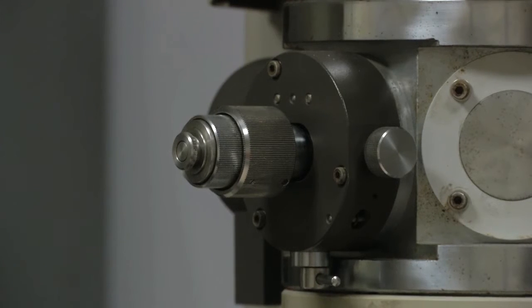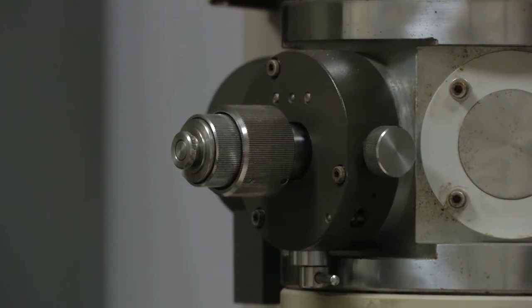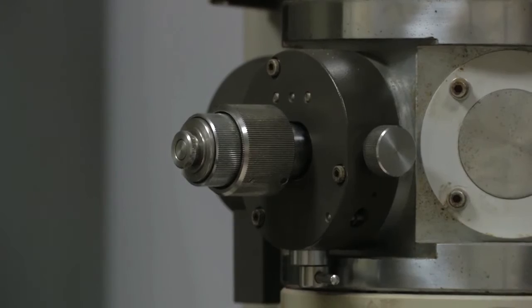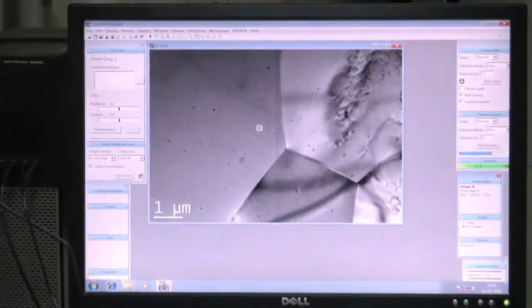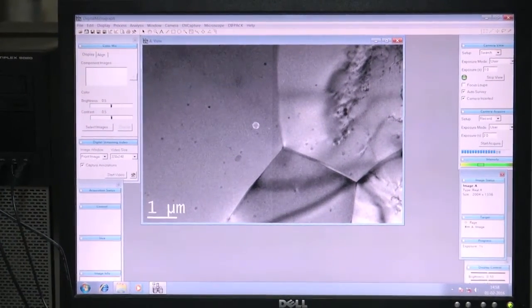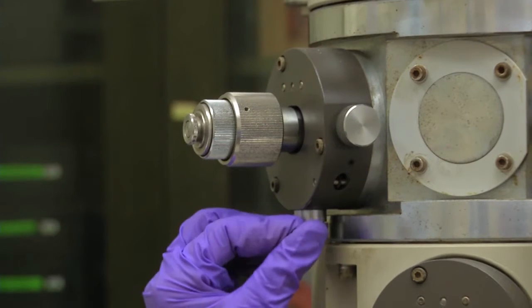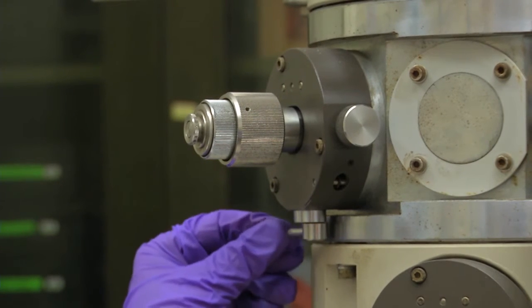This is the objective aperture — we call it the contrast aperture. What you are seeing is the image without the aperture. When I insert the aperture, you will see the difference in contrast.